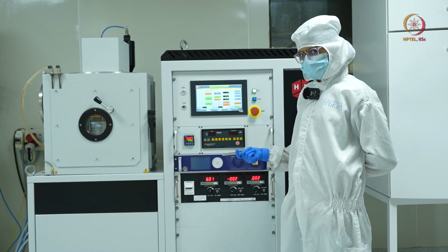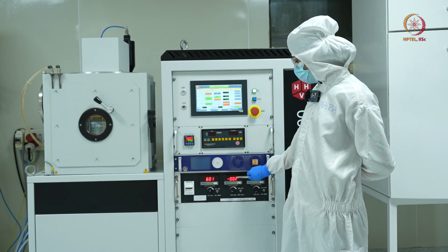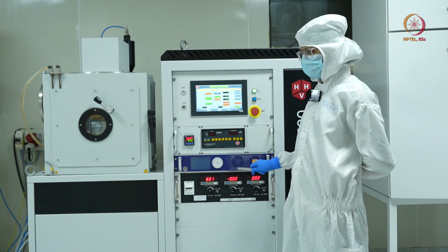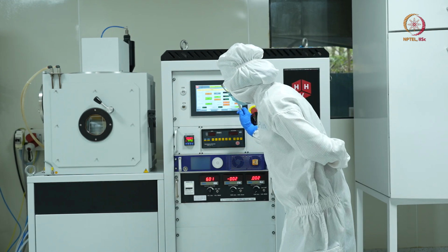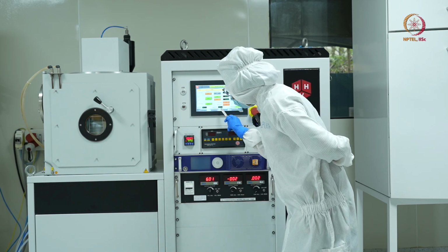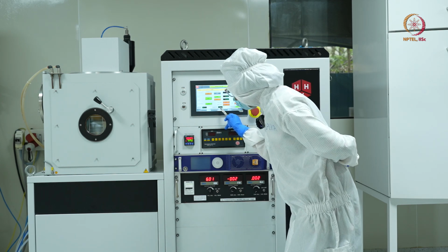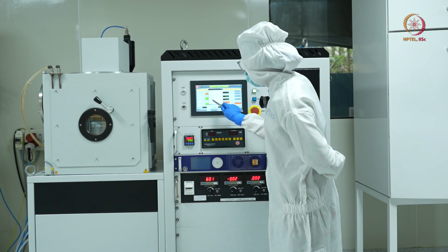Once the plasma strikes, this power will change and you will see some value here. That means the plasma has struck. Now the argon flow is 8, and the sputtering pressure is 3.7 e minus 3 millibar. Now again I'll increase to 10.